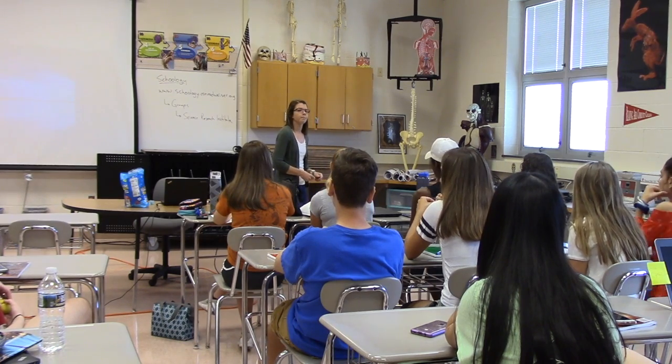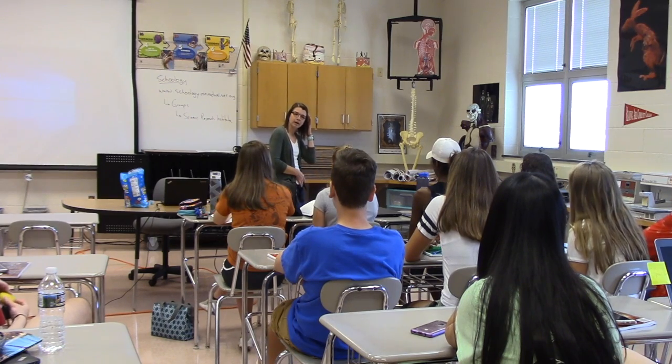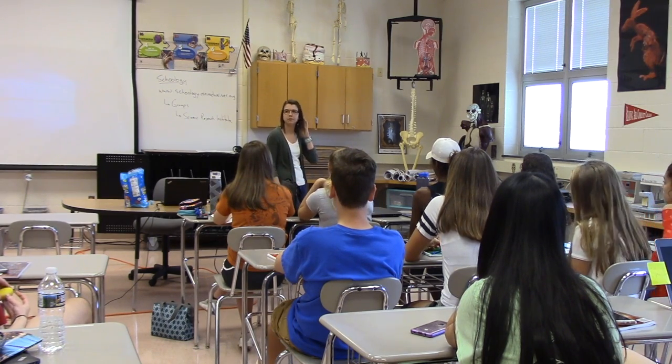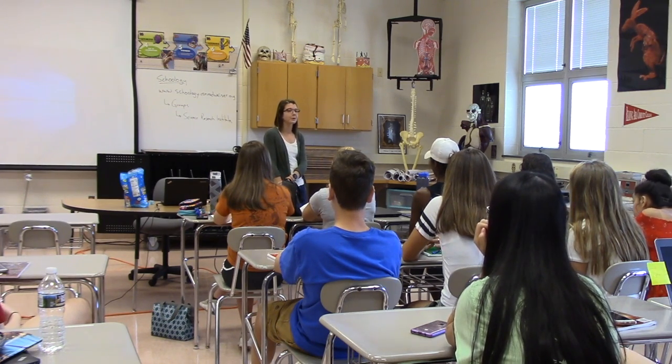So that is actually one of the first steps that we teach our new analysts. So you can actually come to Lancaster Labs directly out of college with no experience, which is kind of nice because Lancaster Labs is willing to teach you everything you need to know. And if I learned anything in college, it was how little I did know when I went into industry, which is completely fine. But with culturing cells, you're having to use aseptic technique, correct? So can you walk me through your aseptic technique here?